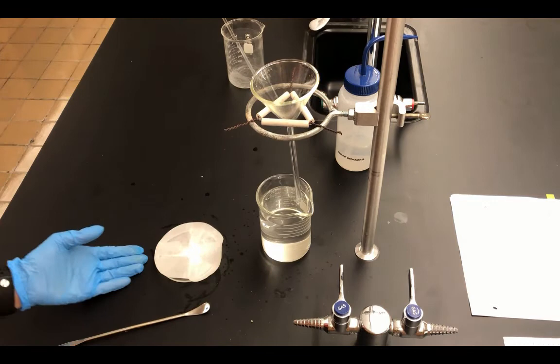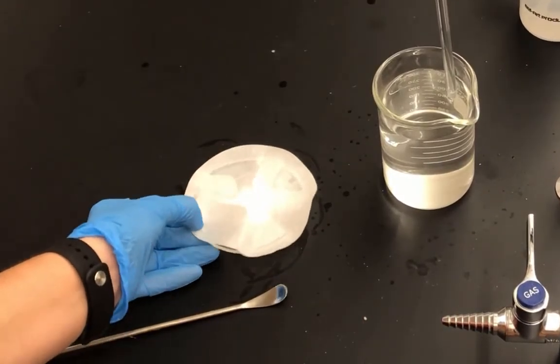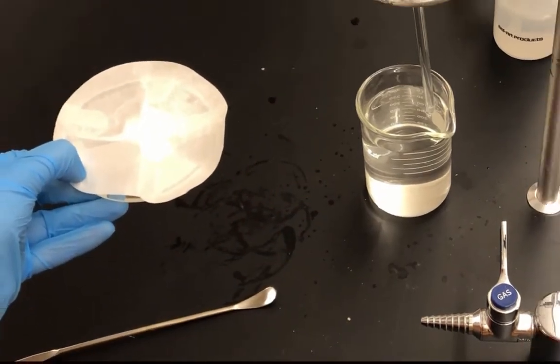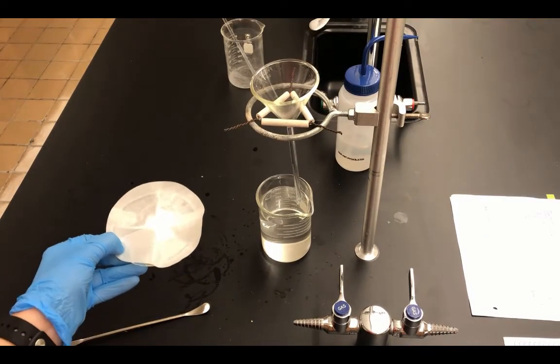And you can actually see that we have a white solid on the filter paper. And what I'm going to do is now transfer it into the drying oven for about 20 minutes to let it completely dry out as much as possible before I take the mass.